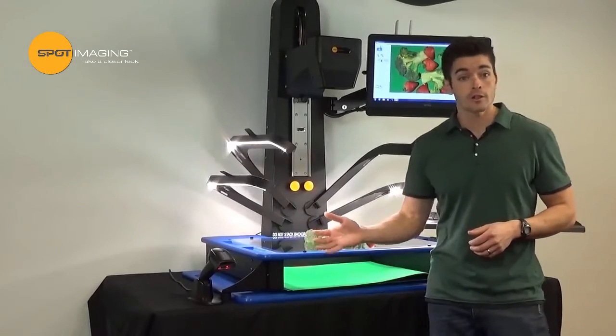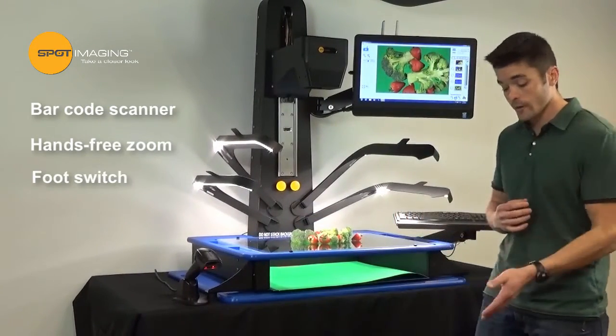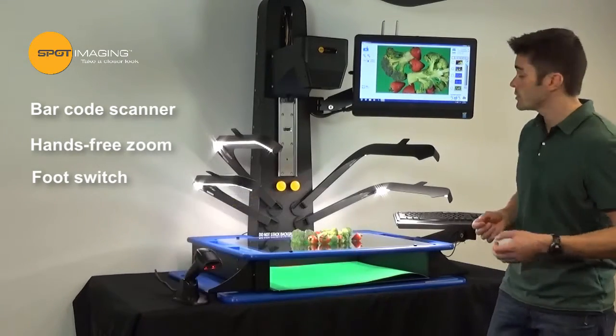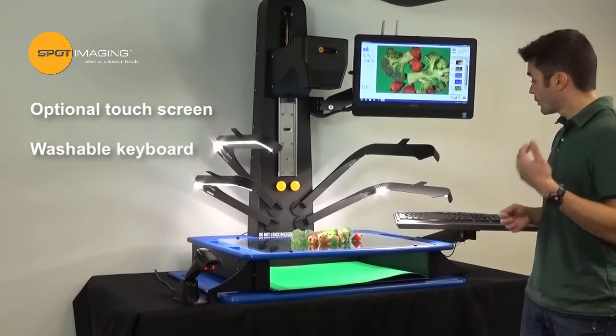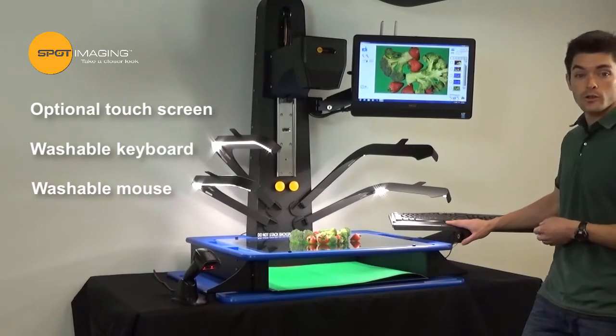To optimize the workflow, we utilize a barcode scanner for accessioning of cases and hands-free zoom and image capture with our foot switch. We also offer an optional touchscreen monitor so you can use a gloved finger or a stylus, or you can always revert back to the tried and true keyboard and mouse — and these are actually dishwasher safe as well.